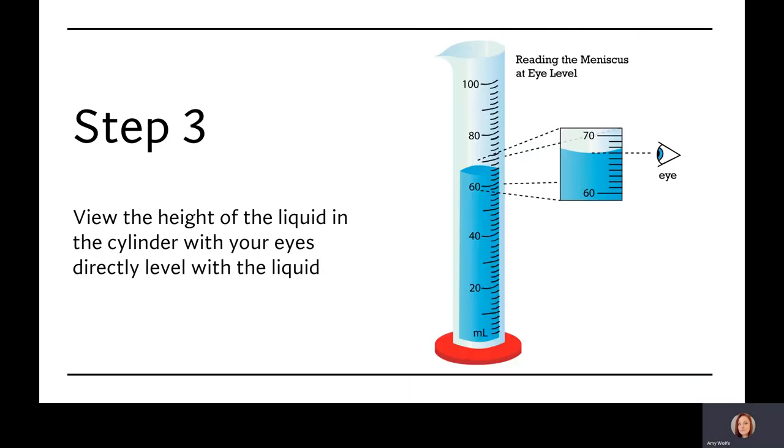The third step is to view the cylinder at eye level to take your reading.